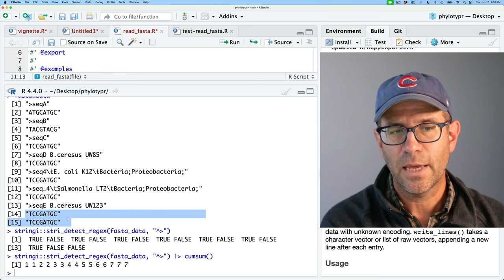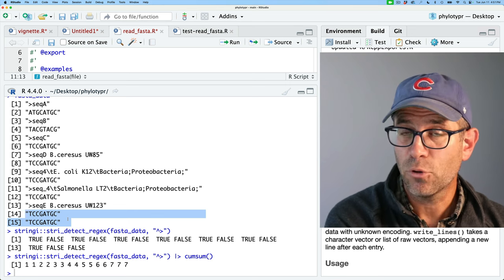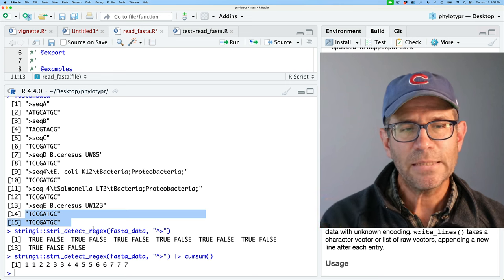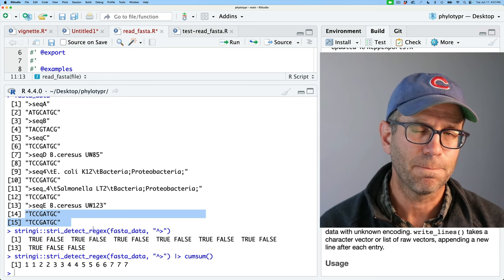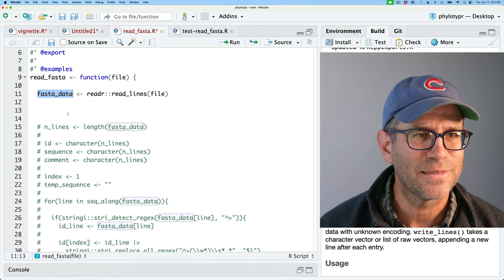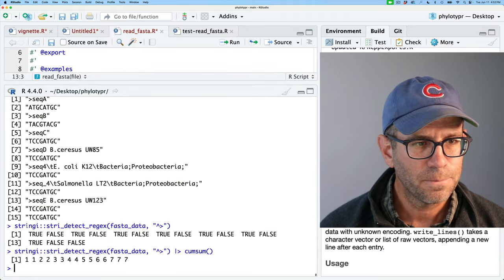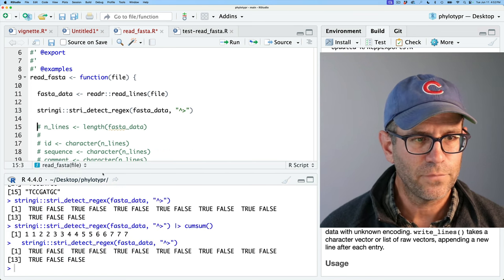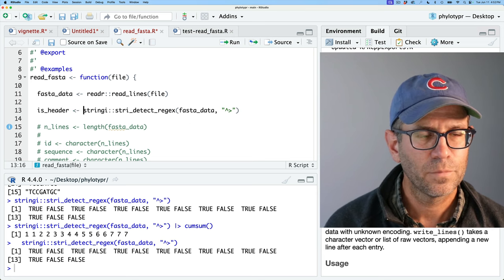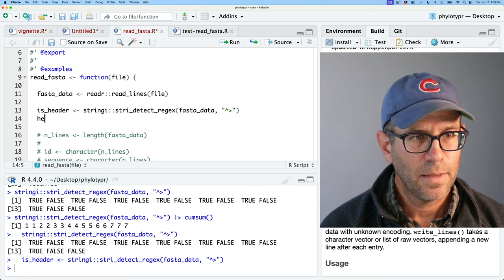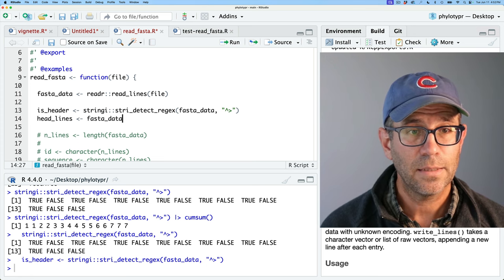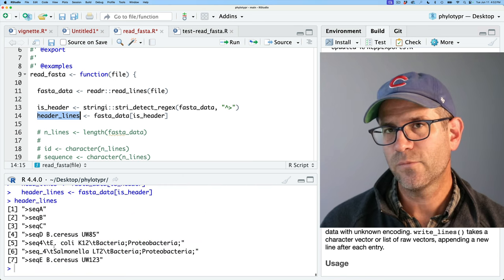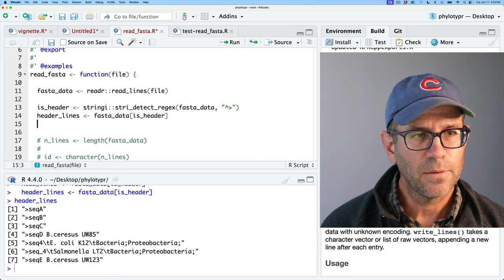Let me show what we can do. We borrow the code from below to get those TRUEs and FALSEs and call it isHeader. Then header_lines is fasta_data where isHeader is TRUE — we see we've got all our header lines. And then we also want our sequences and their sequence numbers, so we'll do cumsum(isHeader) to get all the sequence numbers and call it number.